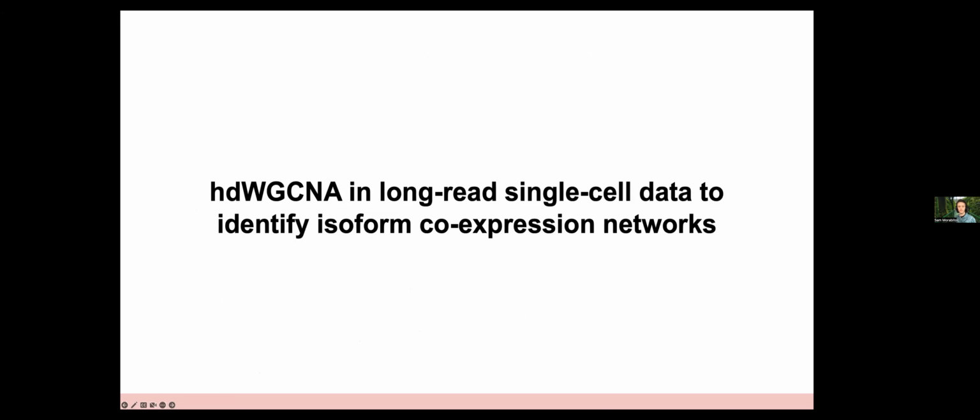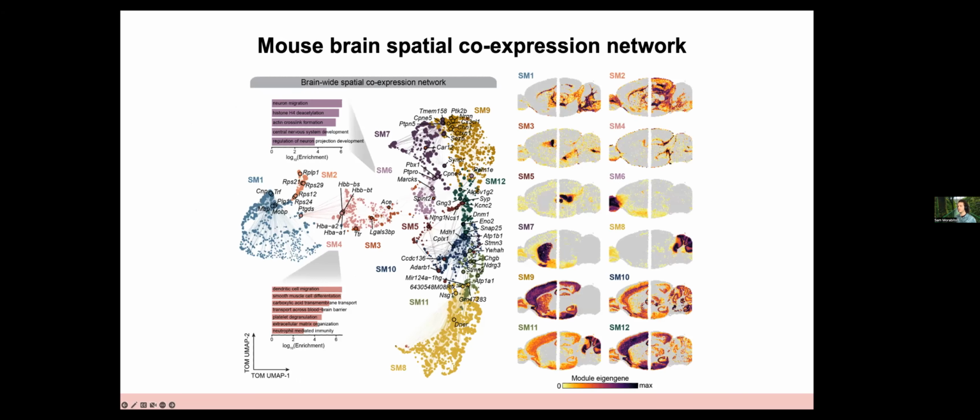So I think with the spatial modules, this is telling you more about what's going on in that region rather than what cell is expressing it. You can infer, like we know oligodendrocytes express MOBP and they're enriched in the white matter tracts, so we can infer that's being expressed by an oligodendrocyte. But the brain has a lot of different cell types. And for some things that are less common, like microglia, they're spread across the whole brain, and there's relatively few compared to the neurons and the astrocytes and other glia. So at least in my experience with spatial transcriptomics, it's hard to pick up on the rare cell types.